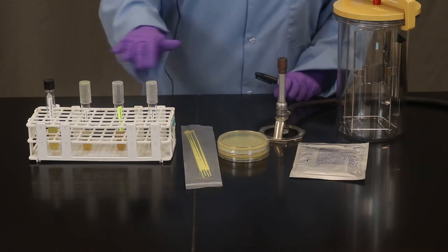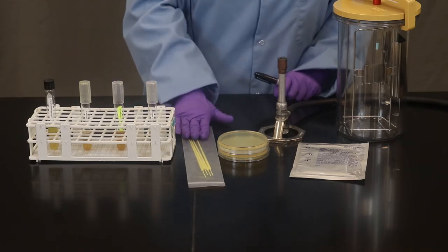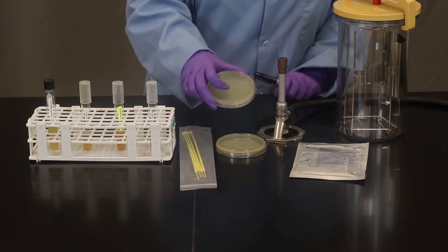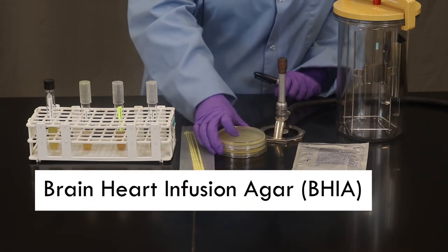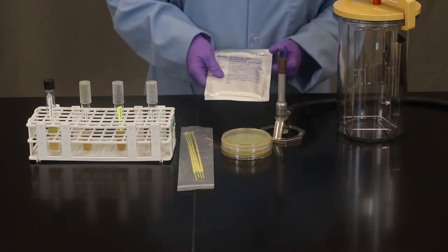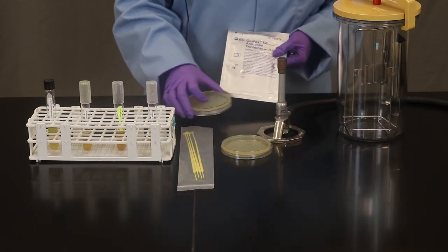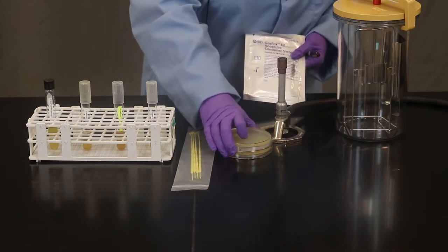In addition to your organisms you're going to need plastic sterile loops, two petri plates both of which are called brain heart infusion agar. We're going to incubate one plate in an aerobic condition just out in the air and we're going to incubate the second plate in an anaerobic condition.